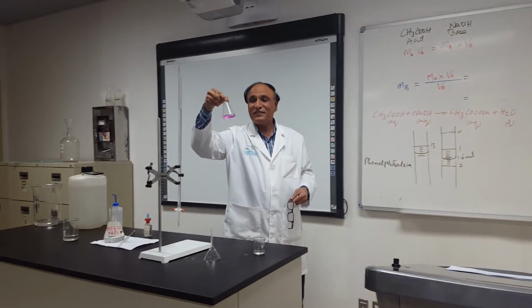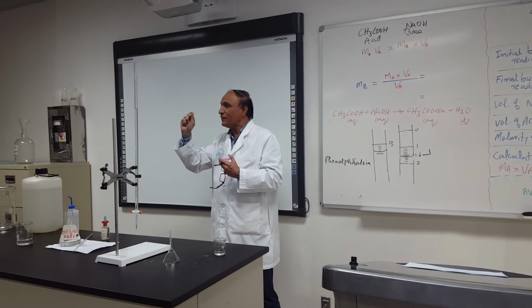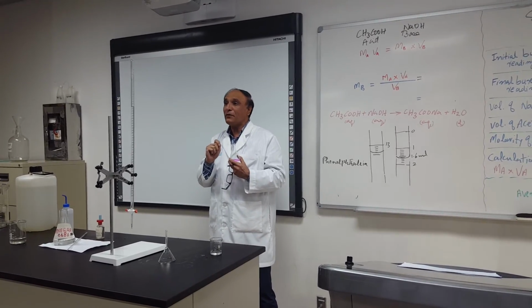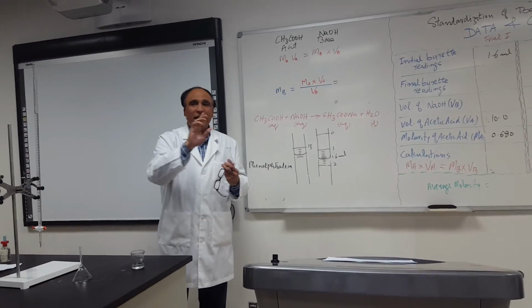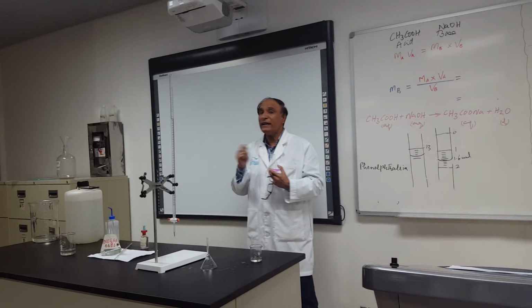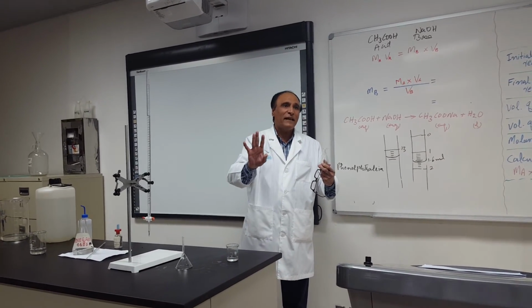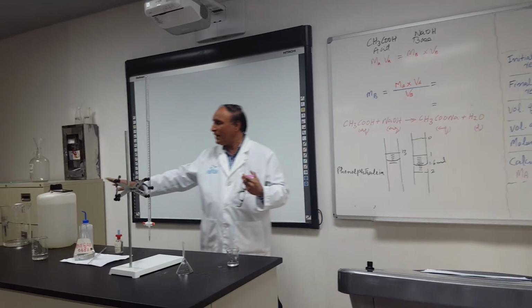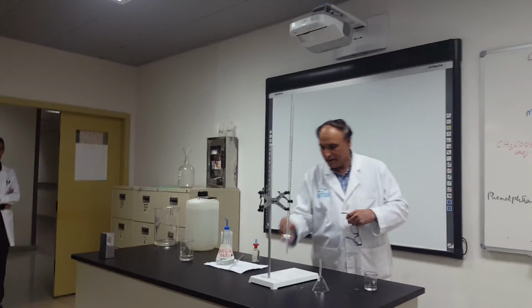Right? So look, we should be very careful in adding the drops, because if we are getting the pink color with one drop, it means that we are doing very nicely. And if you are in a hurry, you put so many drops, then the experiment is wrong. Then the answer is wrong. Then you have not stabilized it. Okay, let's see what happened.